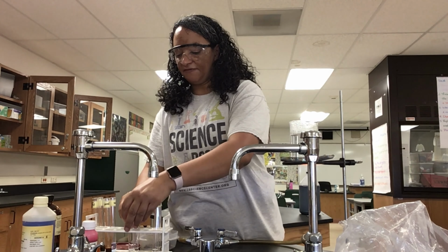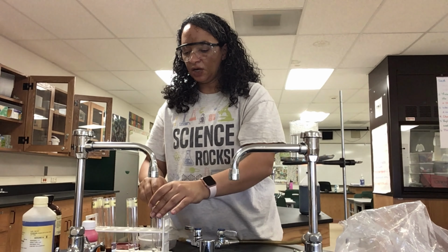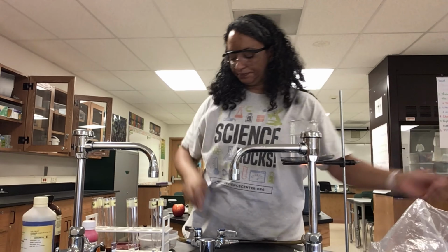This one is going to be my fat test. And then I have a seed and a control. This is going to be my sugar test. And I'm going to go ahead and set up the sugar test first because that one takes a little bit longer. So let me grab a new pipetter.